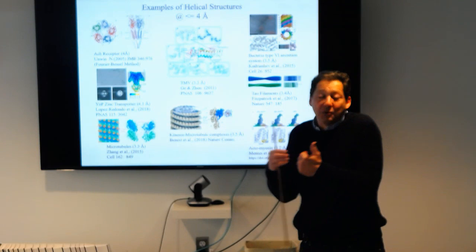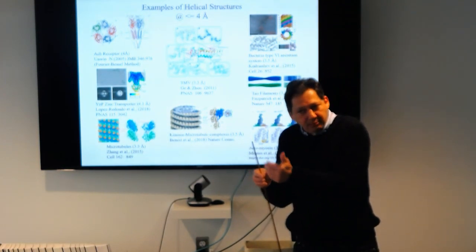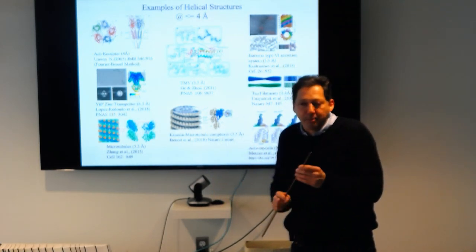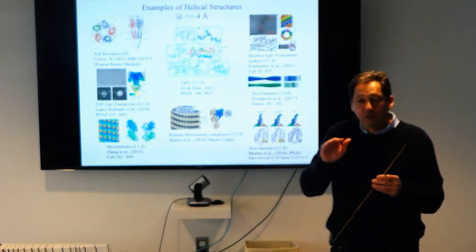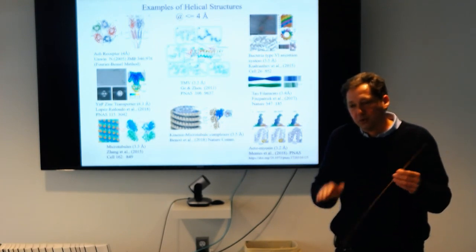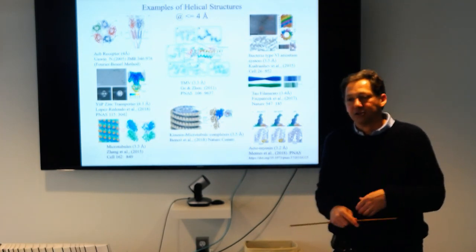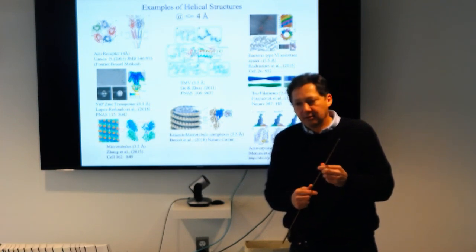And I think we have improved the resolution, but actually we know that we have tweaked the map to increase the resolution. But if you have good data, I would say you just try RELION the first time. Probably you should be able to get there, as long as you know the symmetry of your specimen, because I think you have to input that in RELION first. I don't think there is any program that is gonna magically refine to the right symmetry.